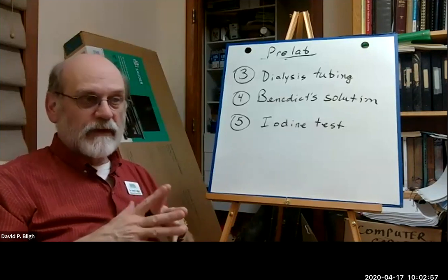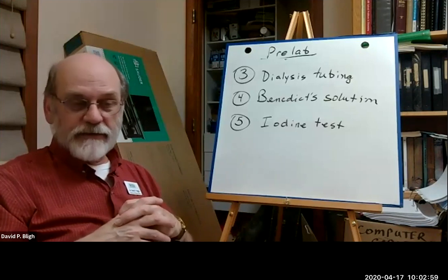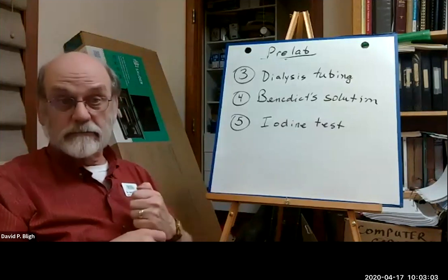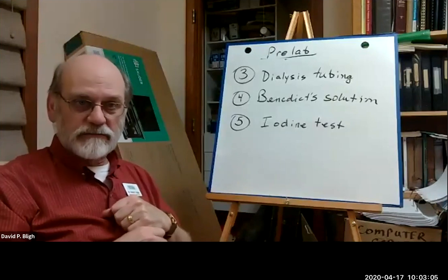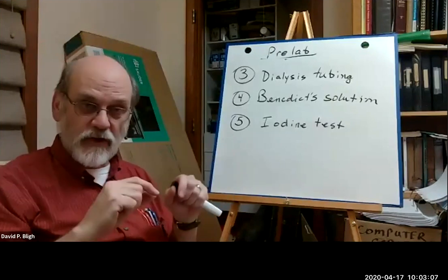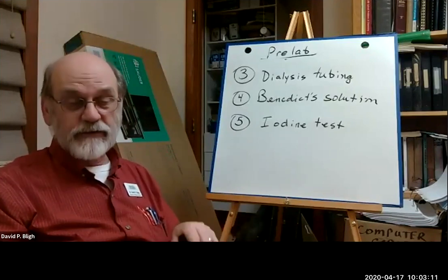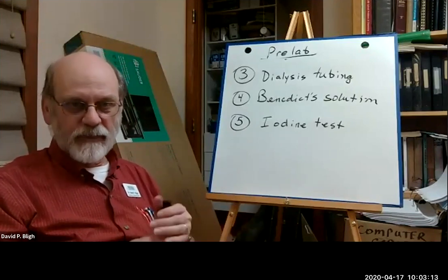I think they used a cracker. Put a drop of this iodine solution on it, and it turns almost black. There's lots of starch in the cracker.